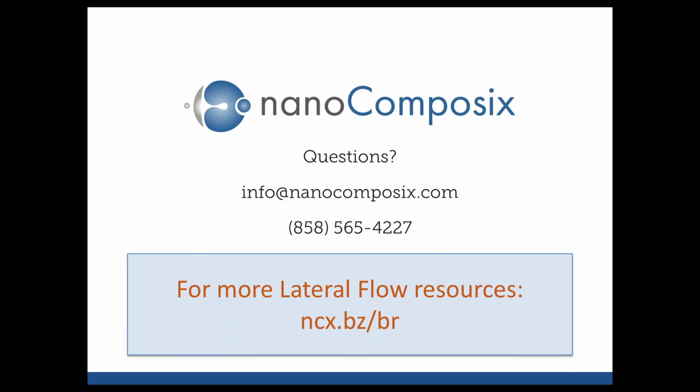Both methods work depending on your application. We like dispensing mechanically, either by hand or with a machine, because it's really important to control the amount of volume that's going on per sample pad. This can really help with reproducibility of your assay results, making sure that each test strip has the same amount of the components as the next test strip.